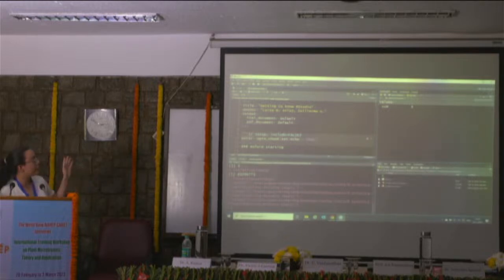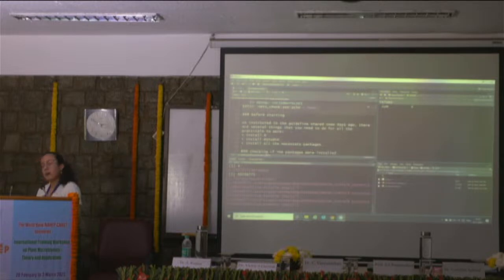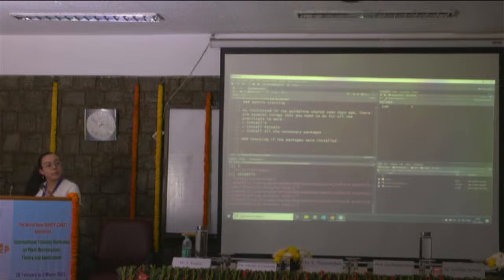And now we have in the notebook something to run. We can also have text, which we do. And then we can give it a quick read, and we all do it together. So before starting, we already did this. We all have R and RStudio downloaded, up and running, because we're all there right now. And the packages, we can look into that. Whoever has errors or problems with that, we can check that later. But for now, we're going to do the exercise.